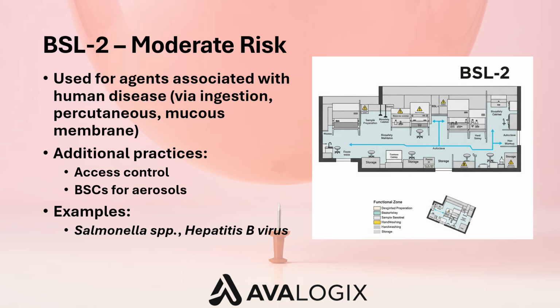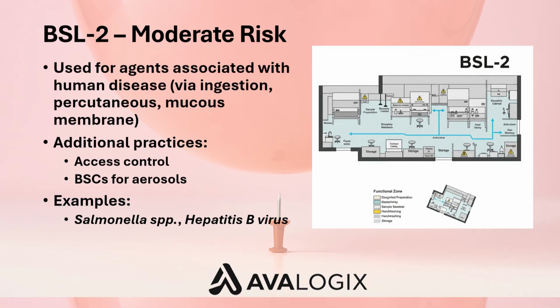PPE becomes more essential. Gloves, lab coats, and sometimes face protection are standard. Waste must be decontaminated before disposal. Overall, BSL 2 introduces more rigor in lab practices while still being feasible in most university or hospital settings.